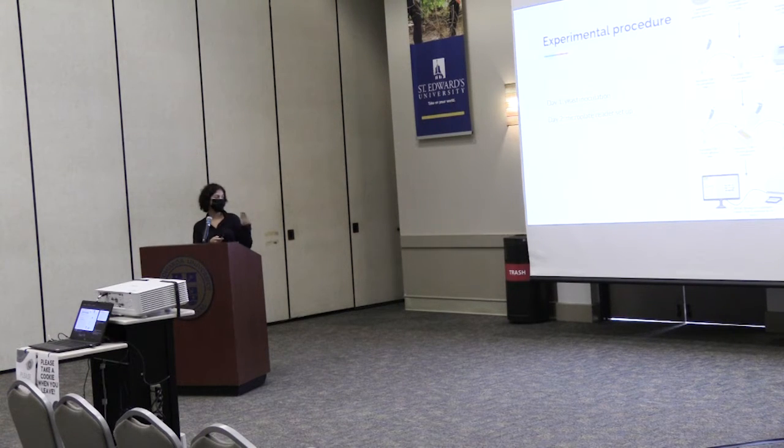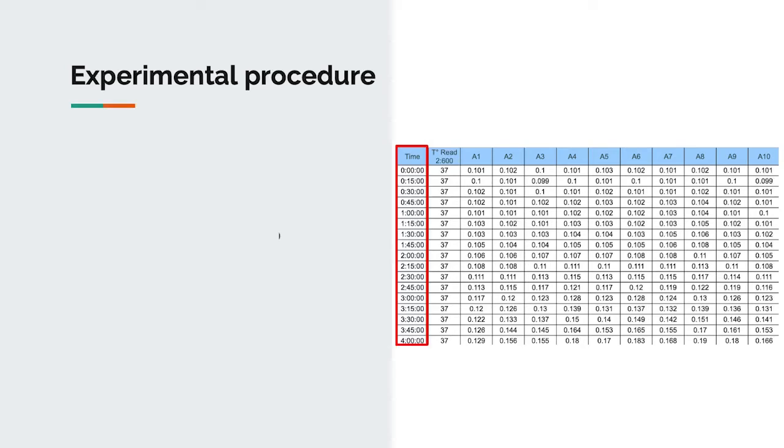And then we put the plate in a microplate reader, set up, and choose a type of shaking, and leave it there for 24 hours at 37°C. So I'm going to show you all the data that we would get from the software. It's a lot, I'm trying to understand it. But this is an example of what we would get.